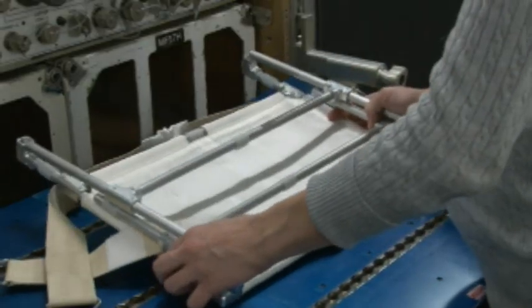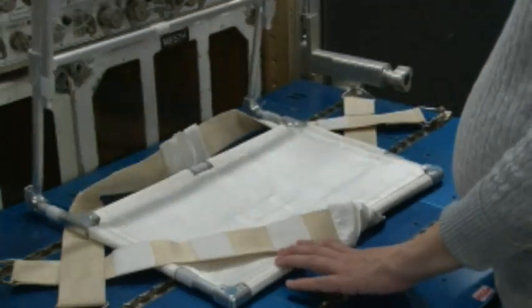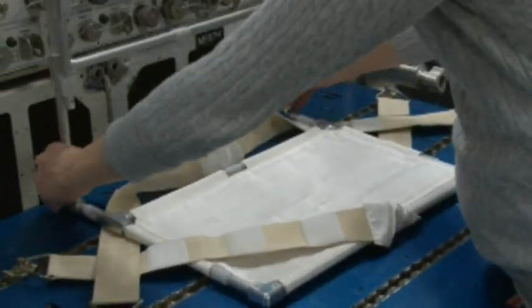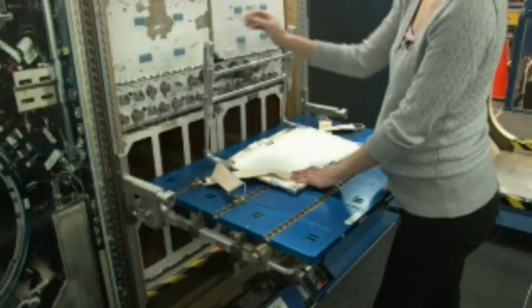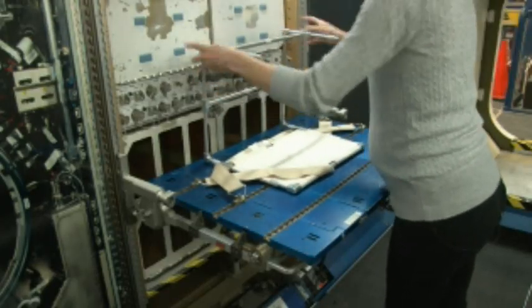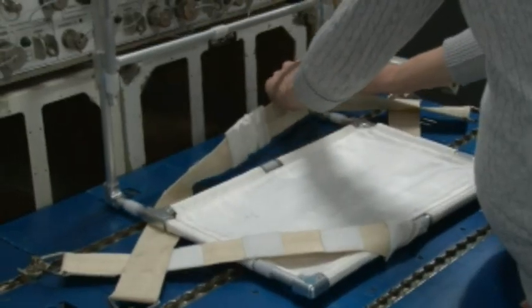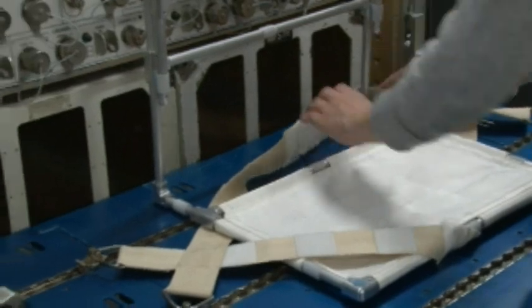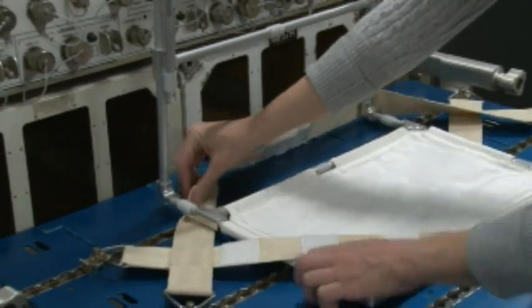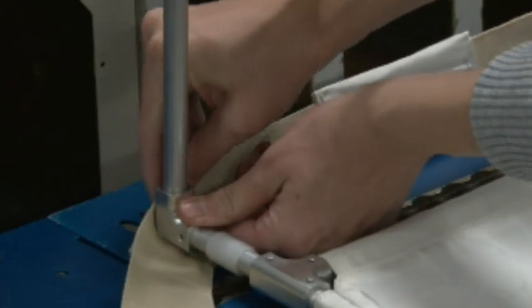Then retrieve the glove bag frame, tucking it into the first strap. You'll deploy the glove bag frame by just popping it into place — it is bungee cord corded together. So that is the deployed glove bag frame. Tuck the second seat track strap around the back of the glove bag frame to secure it in place. It will be tight in order to keep it steady during operations.